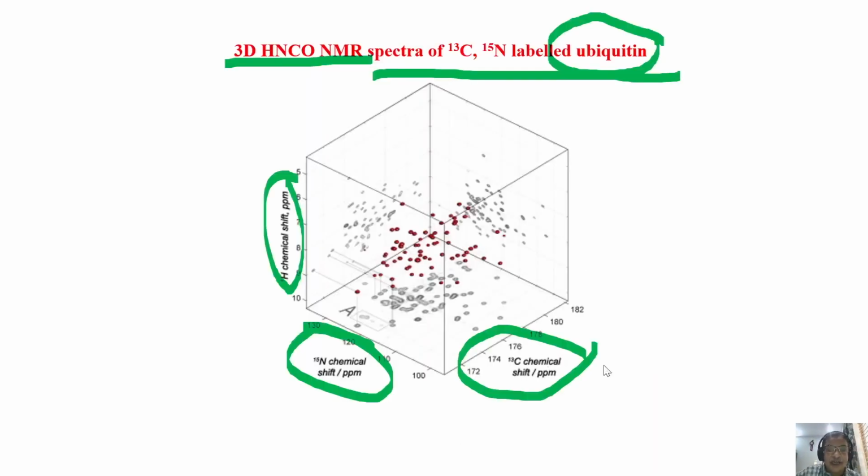Now, what are the benefits of higher dimension? One thing, of course, you saw here: analysis becomes simpler. Why? We'll see that. Let us consider a simple example. We have a molecule where we have different chemical shifts. It could be homonuclear, with several chemically inequivalent protons, or heteronuclear, doesn't matter. We have several chemical shifts, and we also have couplings. Each proton is coupled to another proton or other NMR active nuclei. You have a number of couplings present.